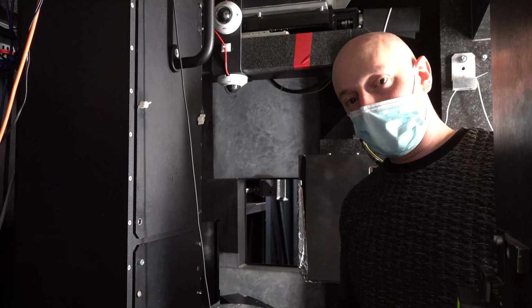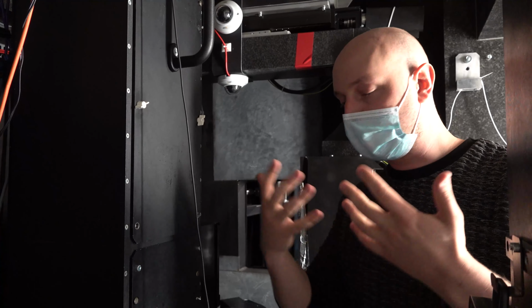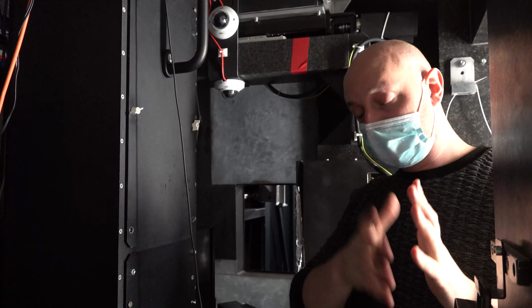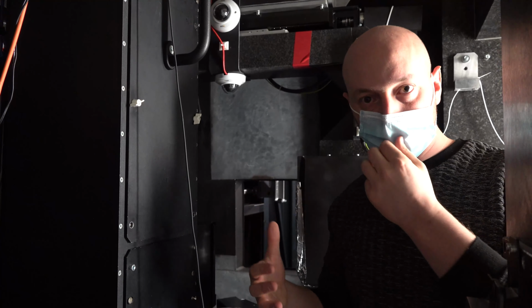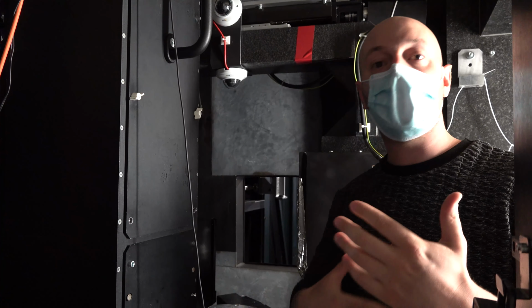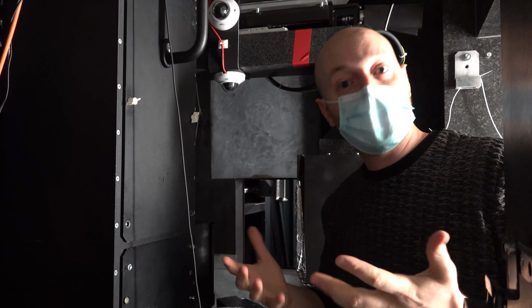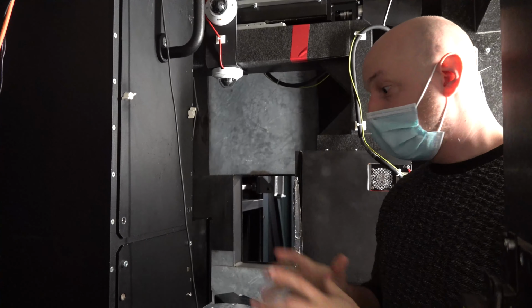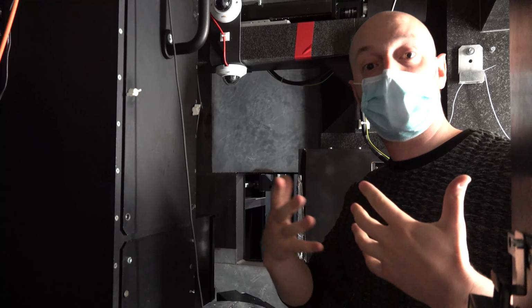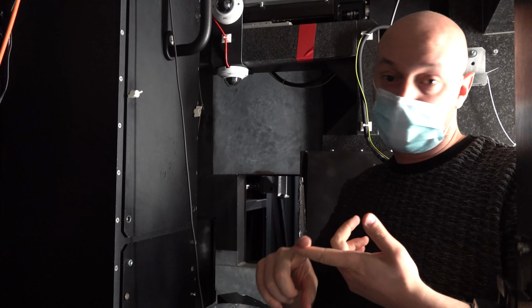Why would that be interesting? Well, when there is a process ongoing, I'm thinking, for example, of a battery discharging or a flow or a compression of a porous medium or some such tests, it is important to have several images as the process develops. For example, one might want to quantify the displacement of the lithium within the battery, or of the water within a porous medium, or of the damaging of a metal under compression. Now, because the two techniques are so highly complementary, it is possible to study different aspects as the process goes on in a sort of 5D, so 3D of the dimension plus time plus the different contrast that neutron and X-rays can provide.